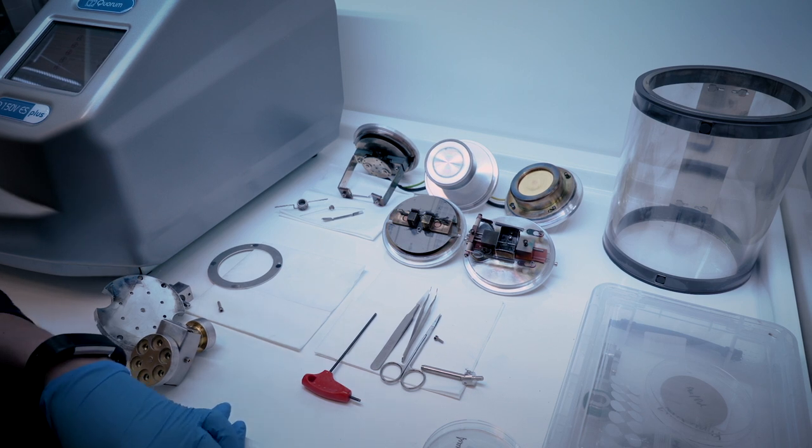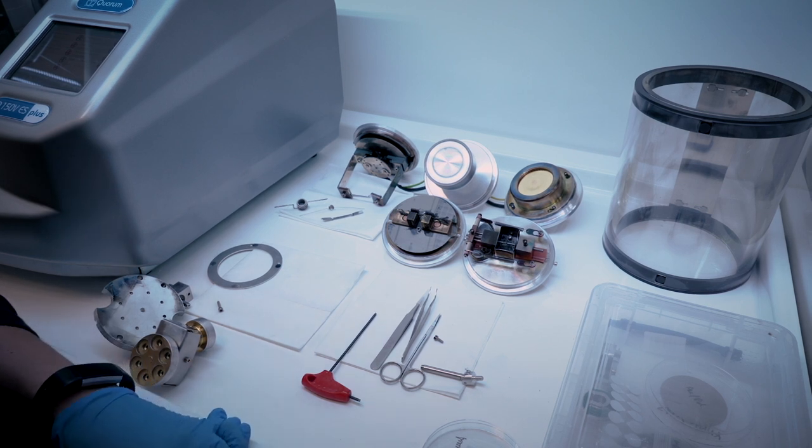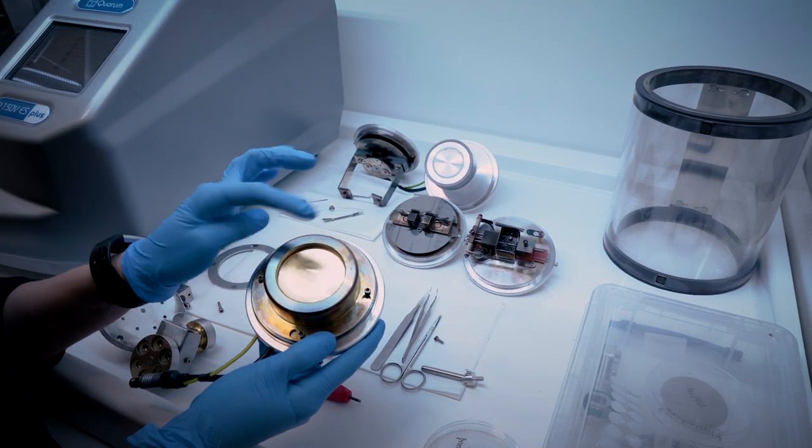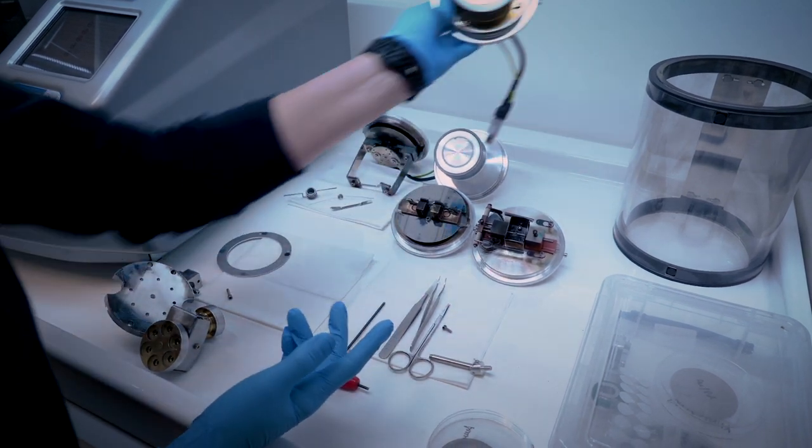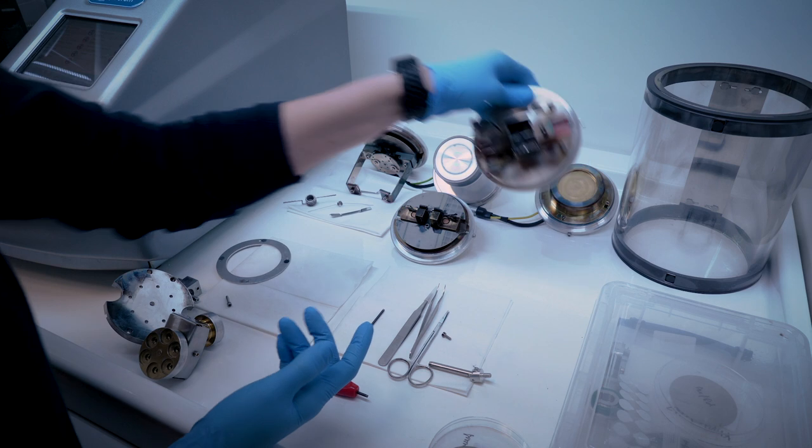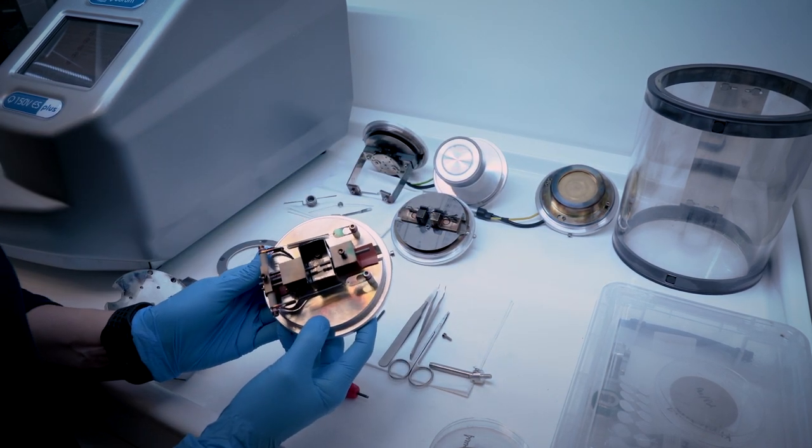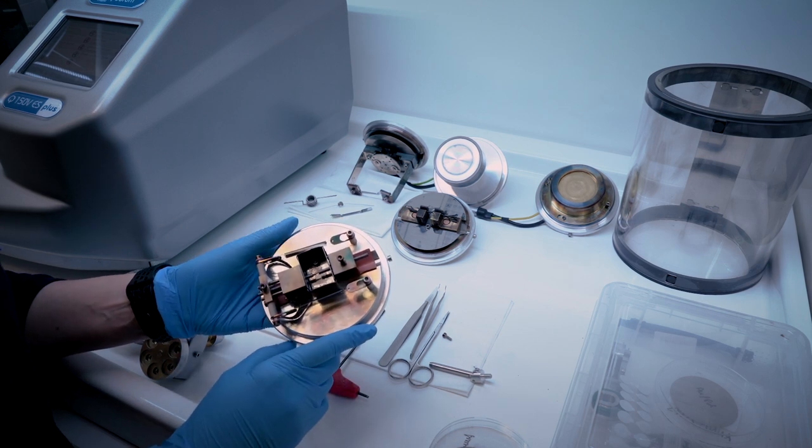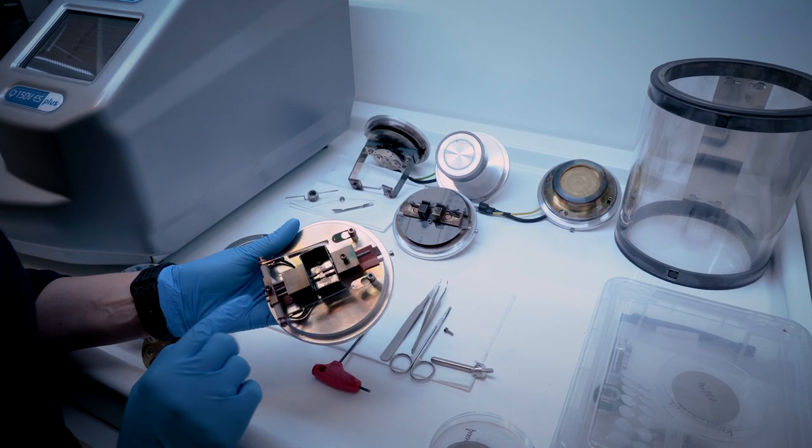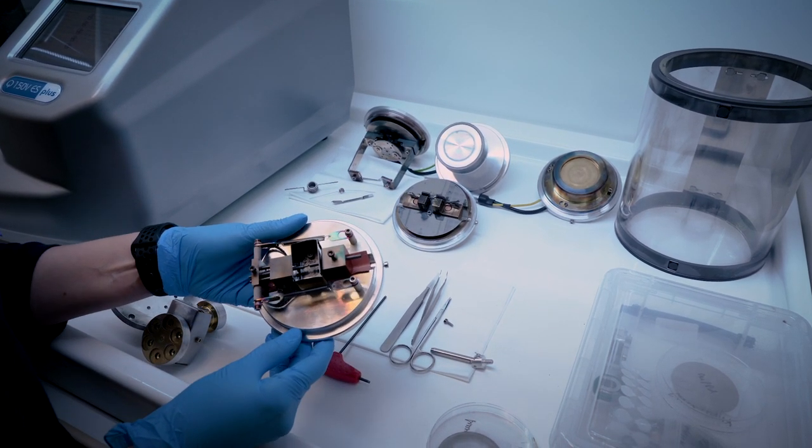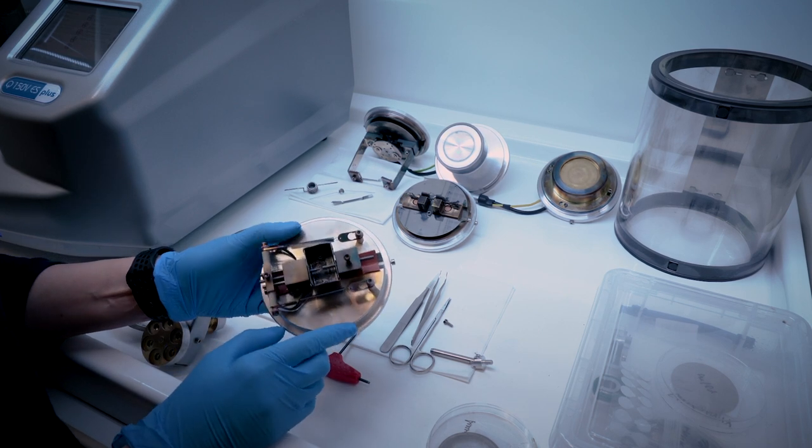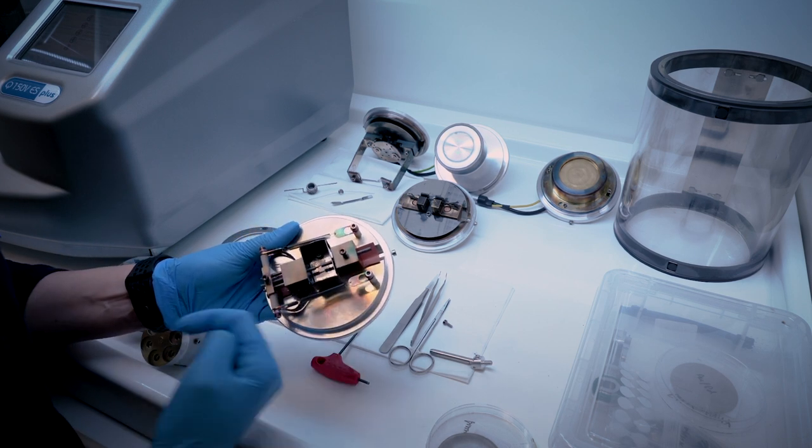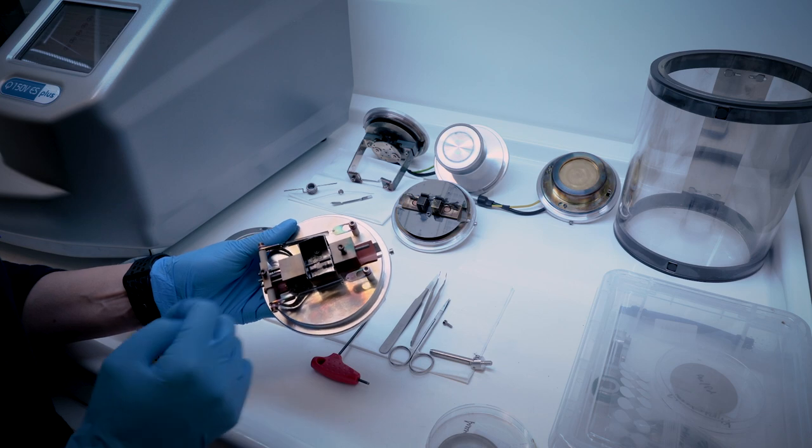As you can see we have plenty of accessories and five heads for the instrument, the sputtering head which has the mount for the target. Another and very important one is the carbon rod evaporation head which has here already mounted sharpened carbon rods. These rods need to be changed every process so you run one process on one set of carbon rods.